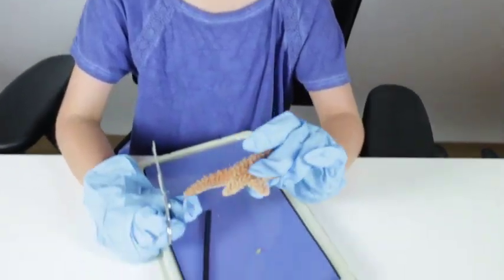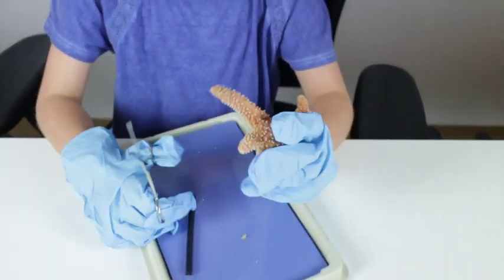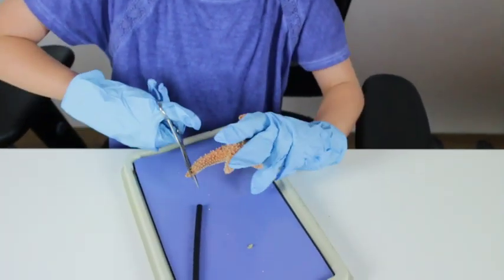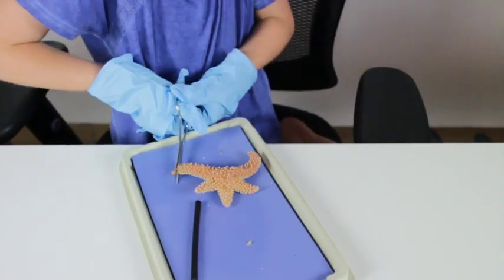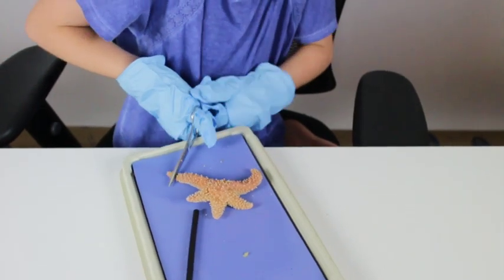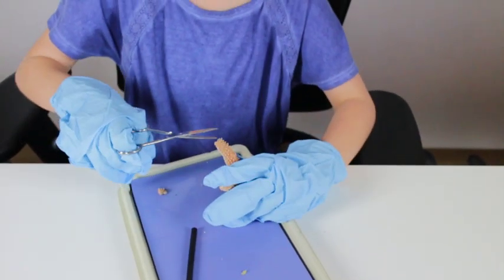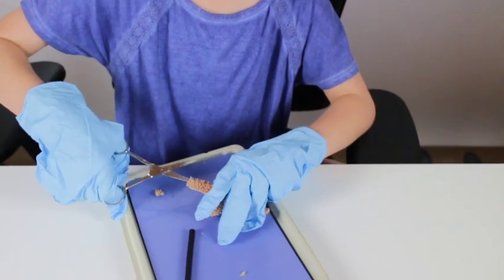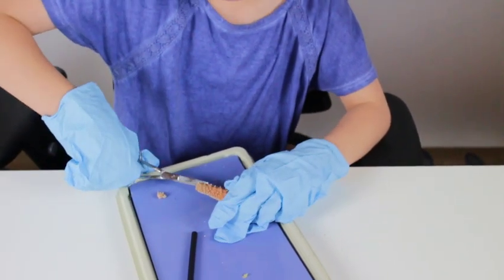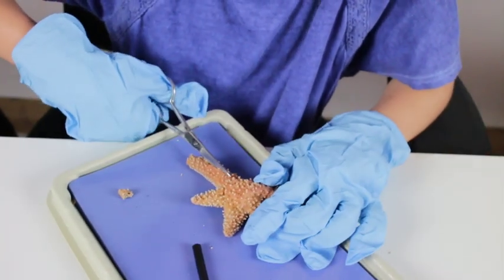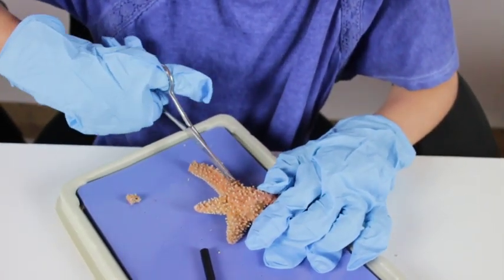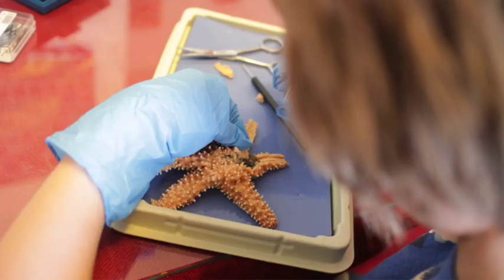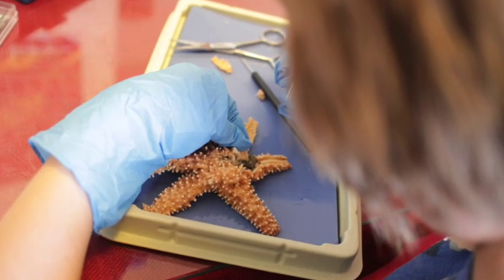So now we're going to start dissecting the starfish. The first thing we're going to do is cut off the tip of one of the starfish legs — I'm using this one because it is both straight and long, which makes for a very good starfish leg. Then there should be a hollow place where you stick your scissors inside of the starfish. I'm cutting it on the side and then going around the madriporite and cutting the rest of the skin so I can lift off the flap and see what is inside of the leg.